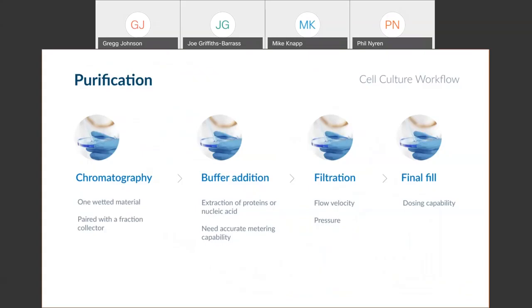So the pump is generally one of the first things that is encountered by the fluid or suspension in a chromatographic separation. And peristaltic pumps are the most commonly used pump type for low pressure liquid chromatography in these types of applications. With these pumps, one of the primary advantages is that the only wetted material is the tubing. And it's generally or oftentimes the same tubing that's used elsewhere in the system. And this limits the number of materials that the solvent or fluid has to contact. It limits the number of materials that have to be validated, tested, or of any concern overall.